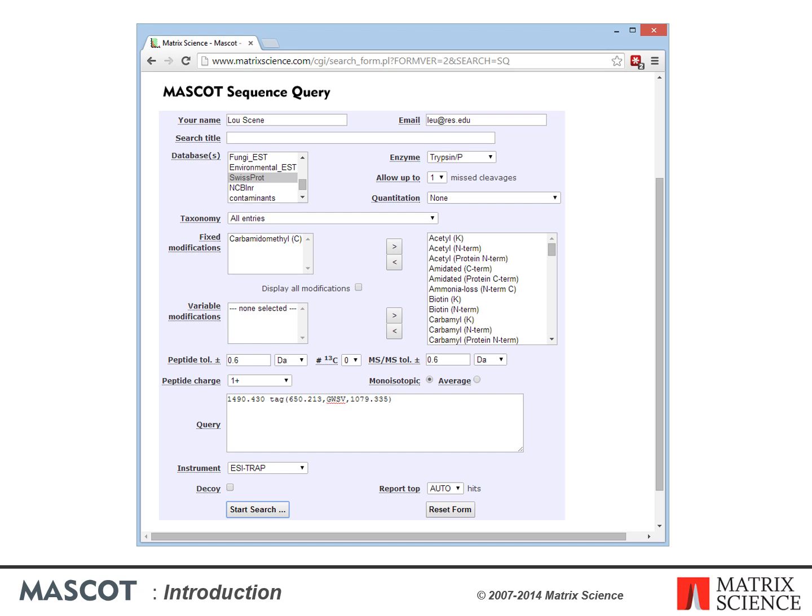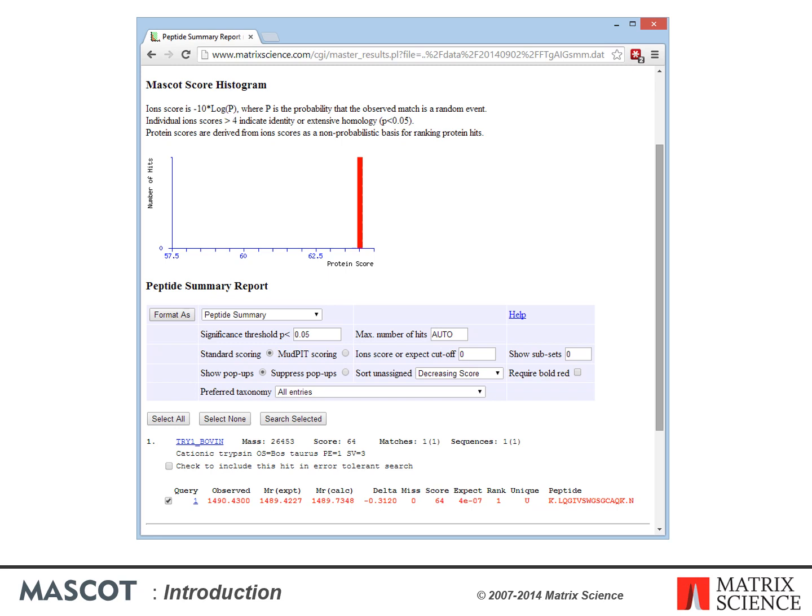Entering the tag into the Mascot sequence query search form requires parameters such as the database and an estimate of mass accuracy. After pressing submit, you receive results. This particular search returns just one peptide from the database that matches — from bovine trypsinogen. The score is good, and even if it wasn't, you're on pretty safe ground accepting matches to trypsin, keratin, or BSA.